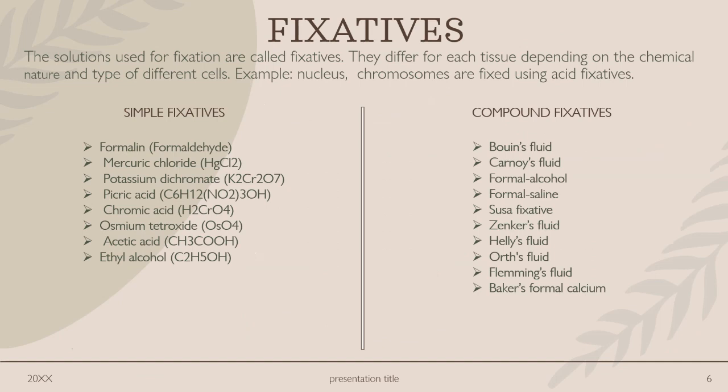Fixatives. As I said earlier, solutions used for fixation are called fixatives. They differ for each tissue depending on the chemical nature and type of different cells. Example, nucleus and chromosomes are fixed using acid fixatives. So fixatives are of two types, simple and compound.